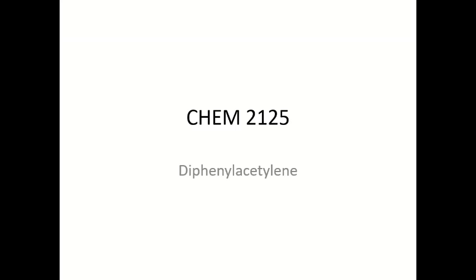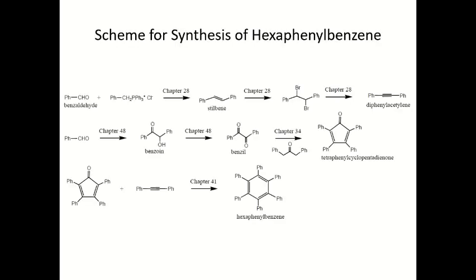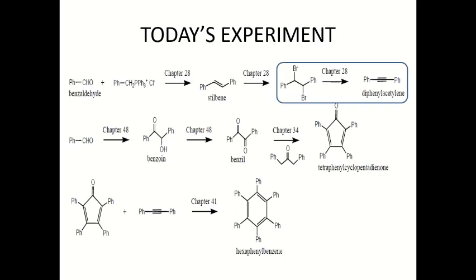Hello, good morning everyone. Today we are going to cover the diphenylacetylene session from your CHEM 2 course. And this is the reaction from stilbene dibromide. Here is the reaction scheme, and this is exactly where we are, which corresponds to chapter 28 of your book.